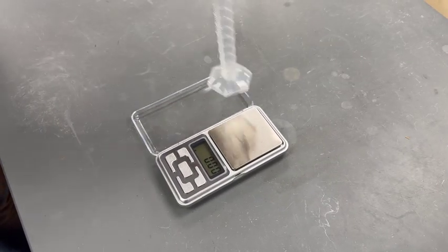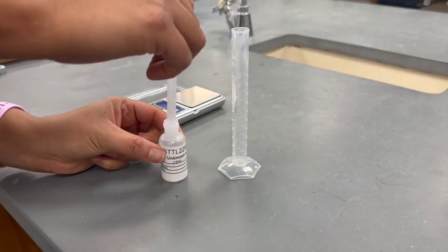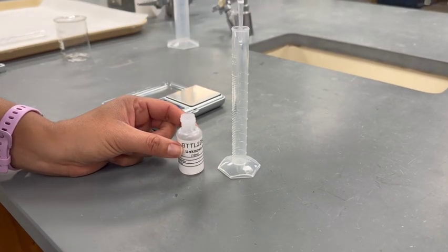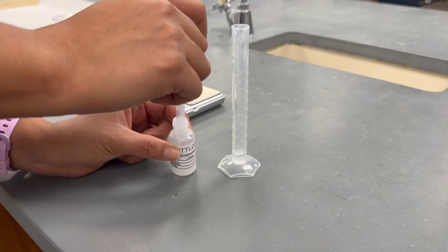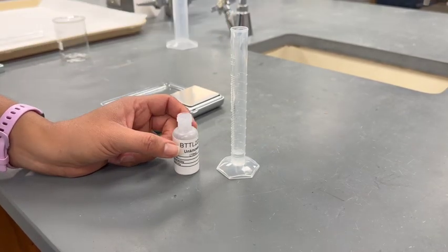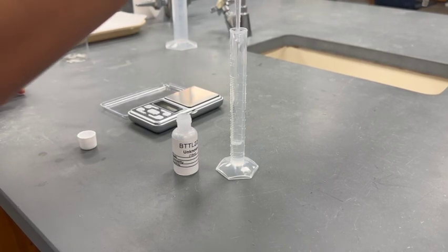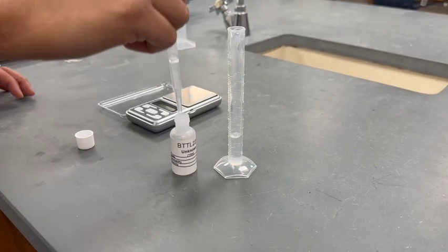Weigh the empty 10 milliliter graduated cylinder and record its mass. Do this three times and record your measurements as trial 1, 2, and 3. Begin trial 1 and use a plastic pipette to add about 3 milliliters of unknown A to the graduated cylinder. Record the exact volume of unknown A. Place the graduated cylinder with unknown A on the balance and record its mass. To find the mass of unknown A for trial 1, subtract the mass of the empty graduated cylinder from the mass of the graduated cylinder and unknown A. Use unknown A's mass and volume to calculate its density.